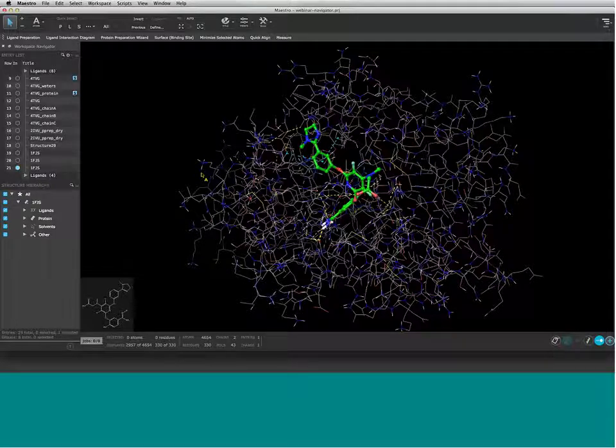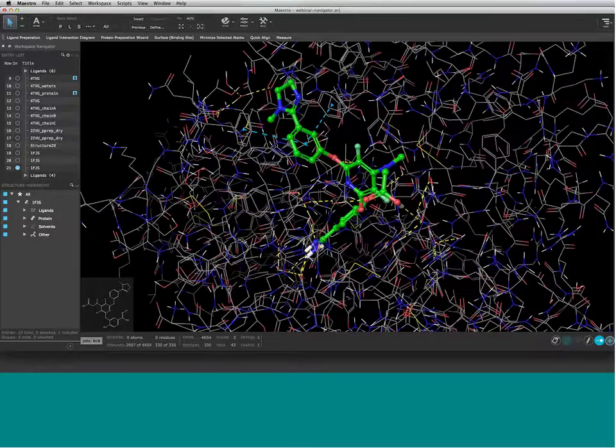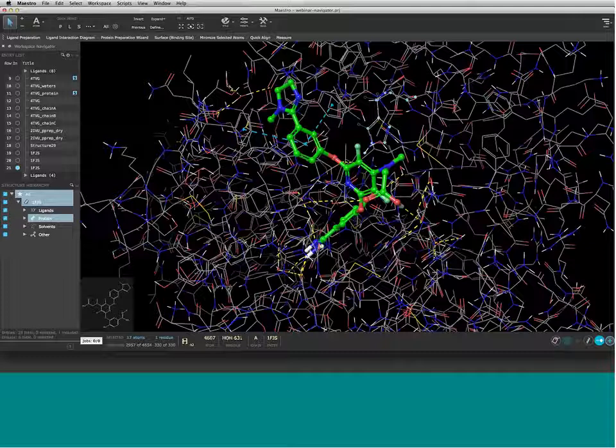First, and perhaps most important, is a very simple tip: you can double-click to expand your selection up to the next level. We did mention this before, but I want to reiterate because a lot of our users switch frequently between atom picking mode and residue picking. There are shortcuts for that, A and R, but you don't really need them most of the time now, because if you are picking an atom and then decide you want the whole residue or small molecule, you can just double click. And this works on the residue, on the small molecule, waters, etc.